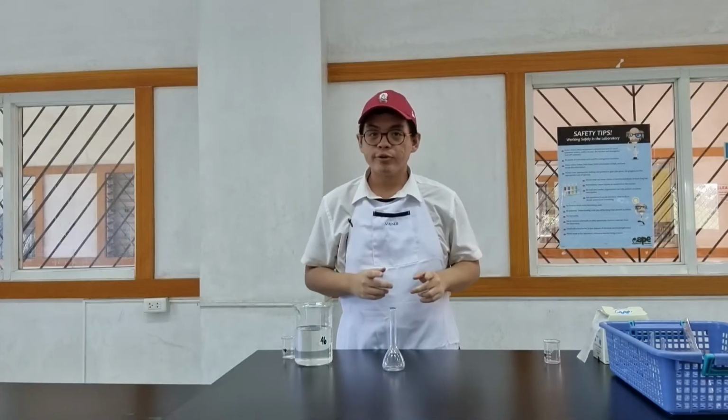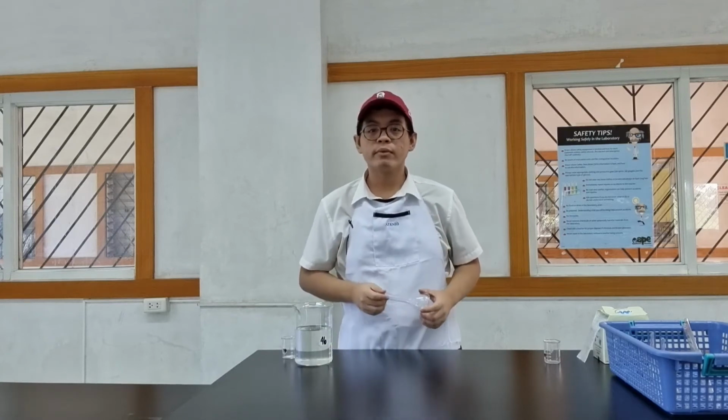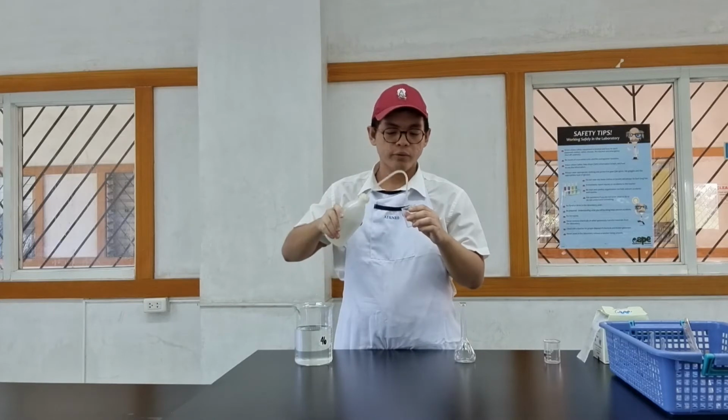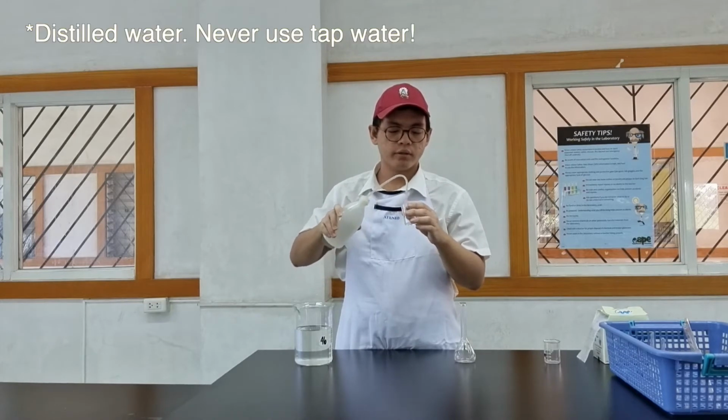Now, I'm ready to show you how I'm going to make the 100 milliliters of solution. So all of my glasswares here are clean. They've been washed with soap and water, and they've also been rinsed with distilled water and dried. So what is the first step? This is a wash bottle. I'm going to add just a little amount of water to dissolve the solid.